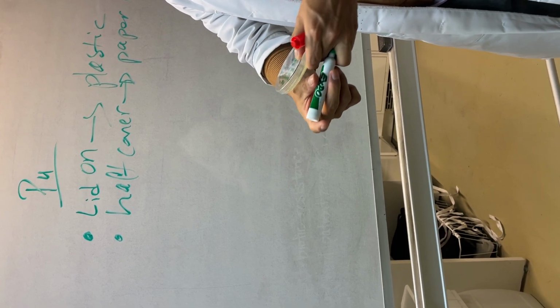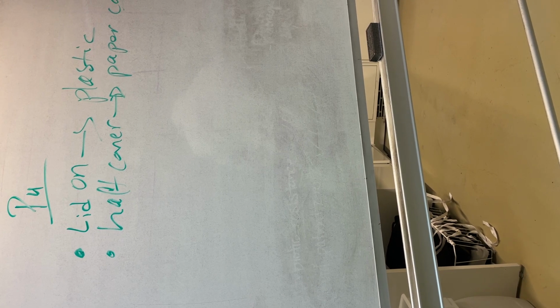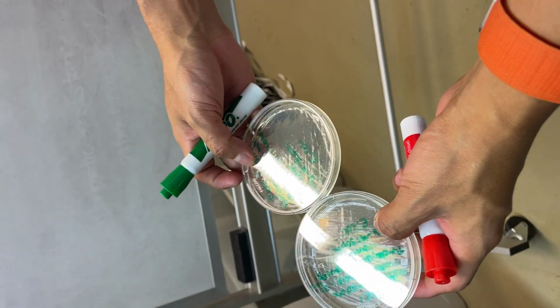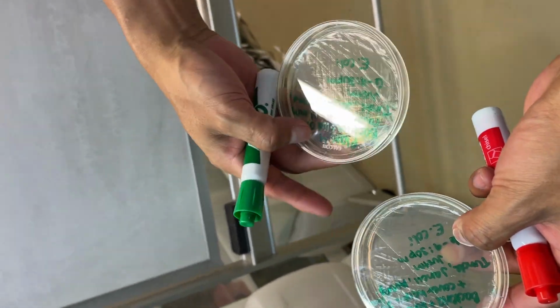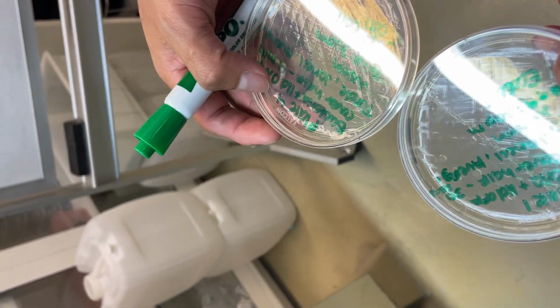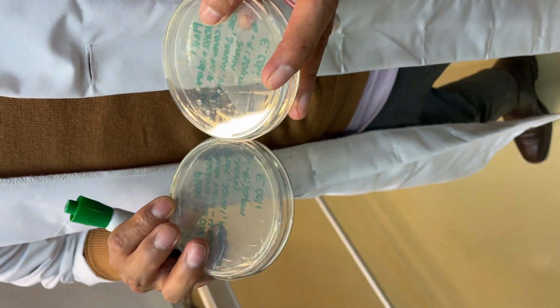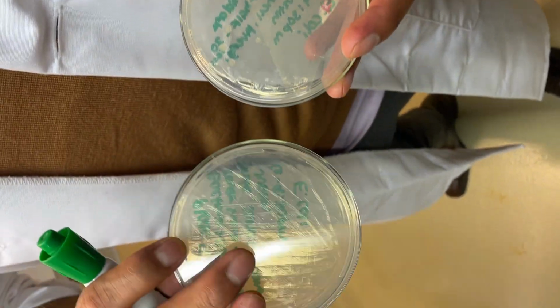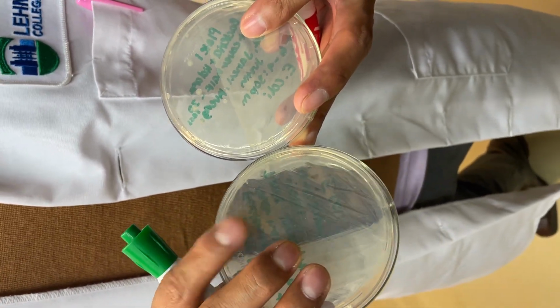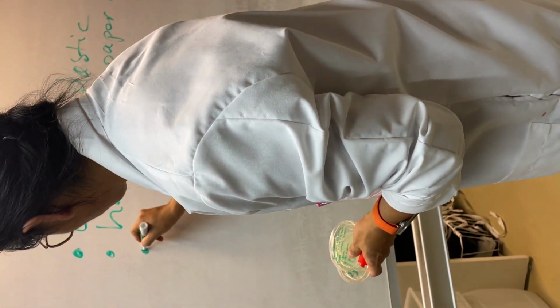Okay. So what is that talking about now? Now I can say, okay, based on this, I want to compare it. If I compare this and this, this one has more bacteria growing than this one. Notice that? What's the difference? In color, just in color. Take a look, this one right here is slightly darker compared to this one. So what I can say is, next bullet point.